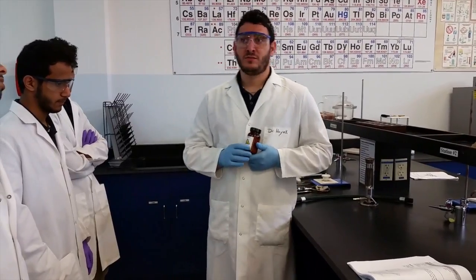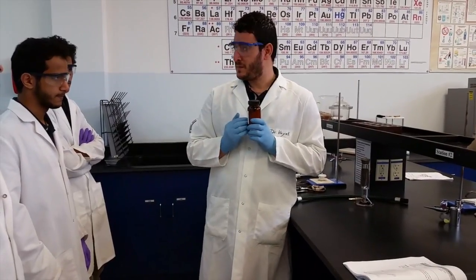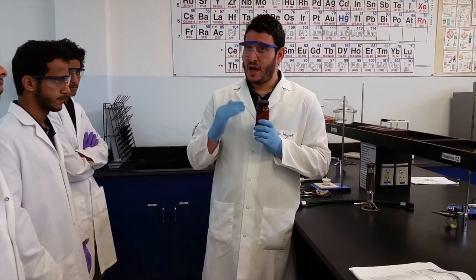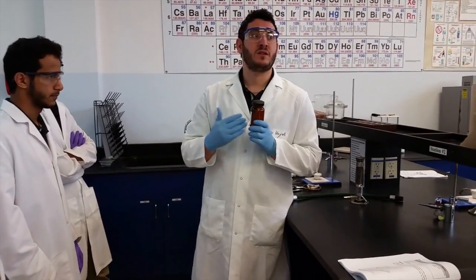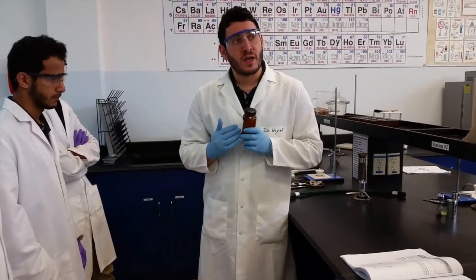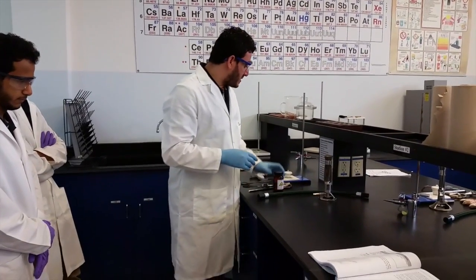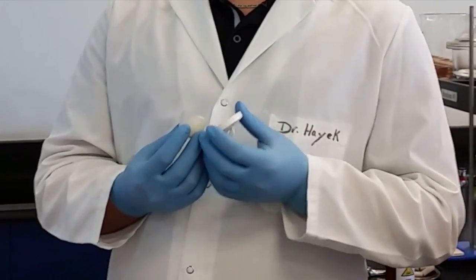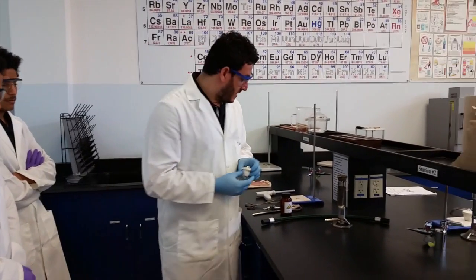If I know the mass before heating and I heat it and take the mass after heating, I can know the mass of water because water evaporated - the difference gives me the mass of water. I can also calculate the mass of the anhydrous, because if I know the mass of empty crucible, I can subtract and get the mass of the anhydrous.